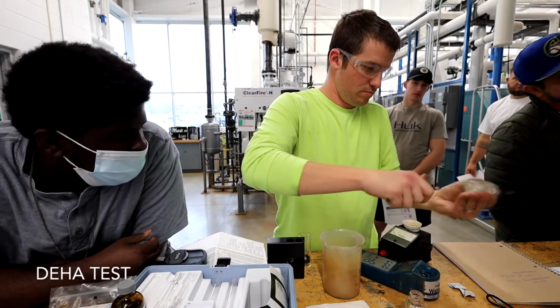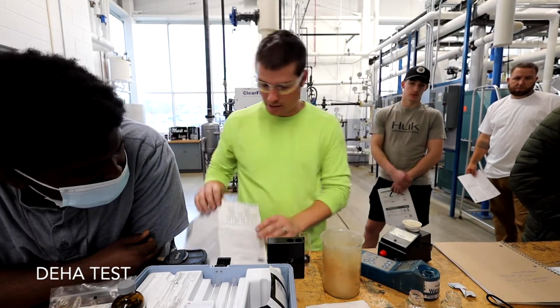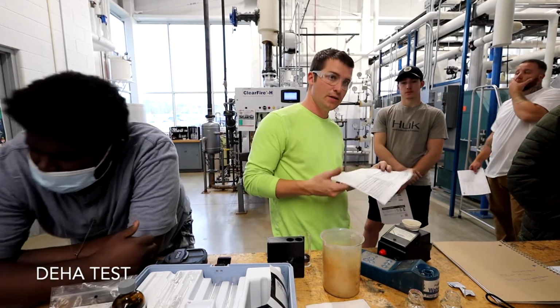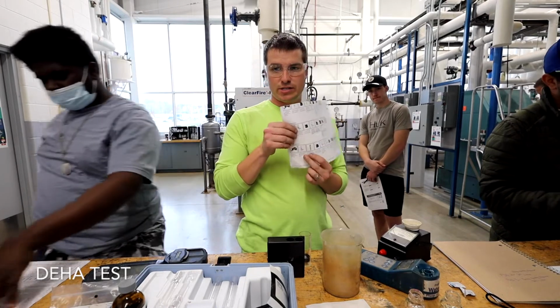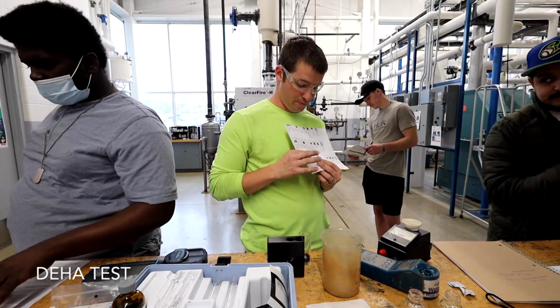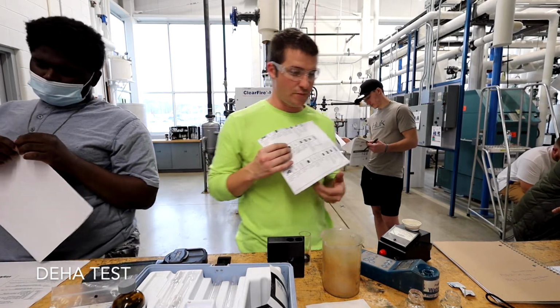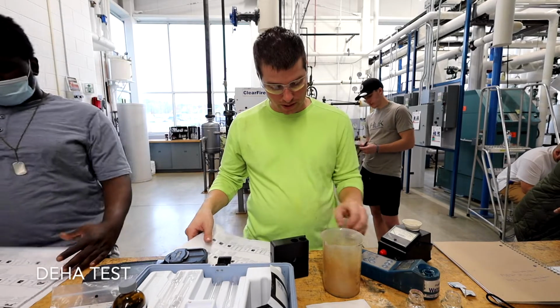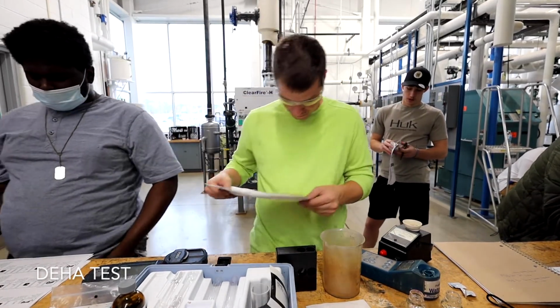Tap it, shake it. And now we start timing. So this is, again, unfortunately, kind of a long test. If you read, it's a 10-minute wait time. You're looking at the high range measurement as the step we're going to go to. We don't care about low range or mid range. We only care about the high range because that's where we're trying to maintain it. So now we can do the rest of the prep work while we're waiting on that to cook.